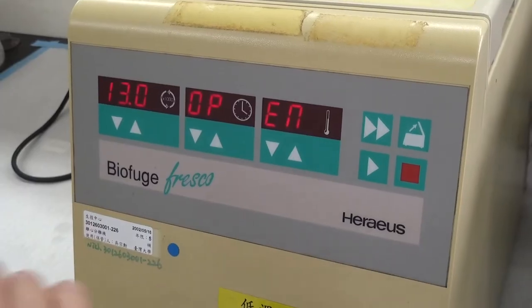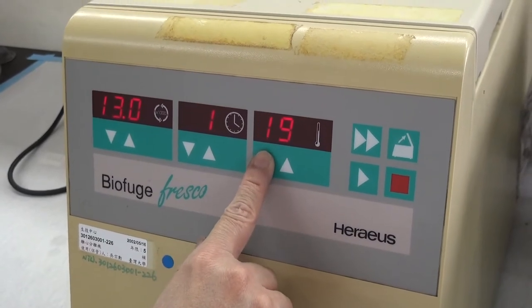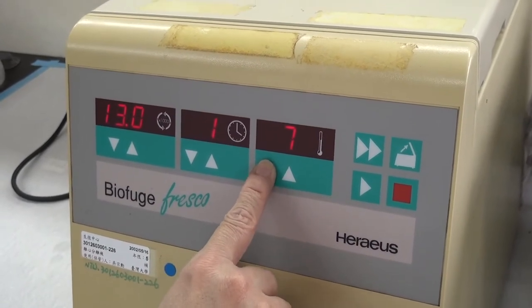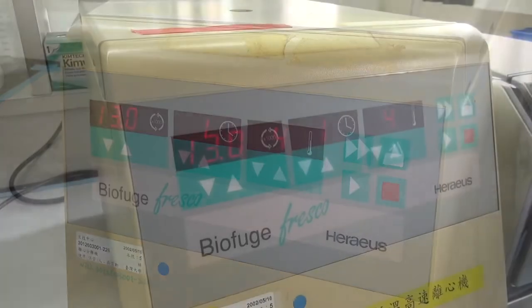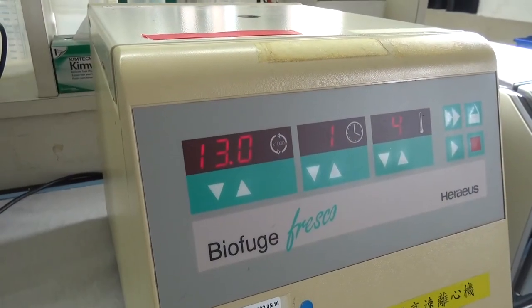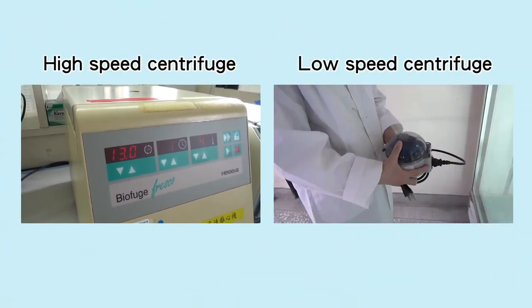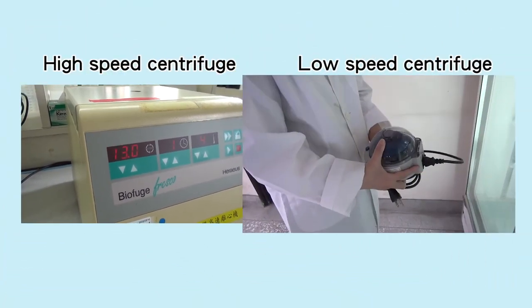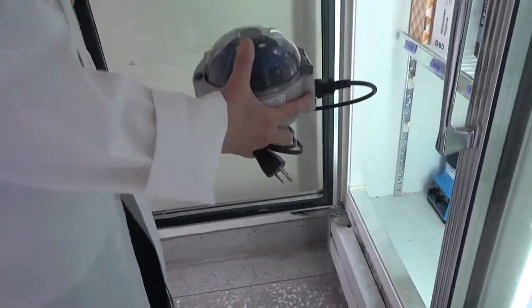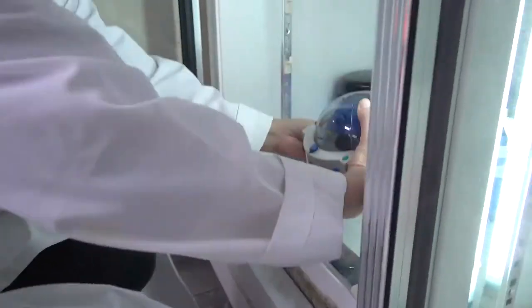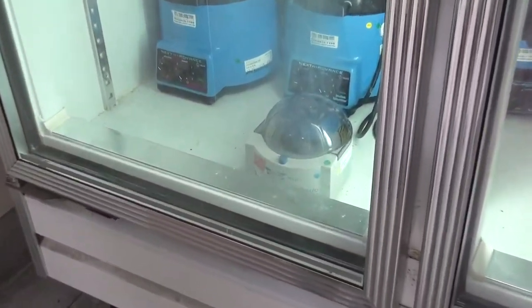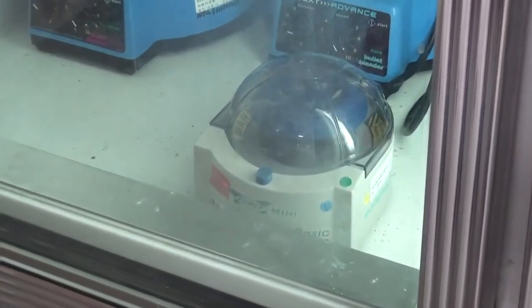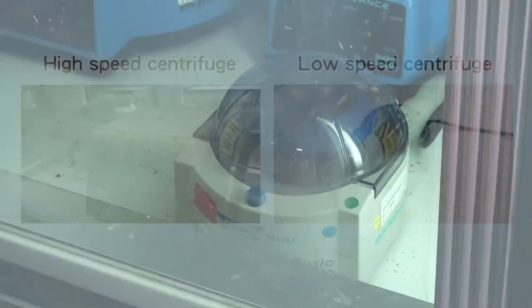If low temperature is required, the centrifuge must be set to pre-cool to a certain temperature. Remember to close its top lid to maintain low temperature. If the centrifuge does not have a cooling system by itself, it can be placed into a cold room or refrigerated cabinet. Continue with the operation after the required temperature is reached.